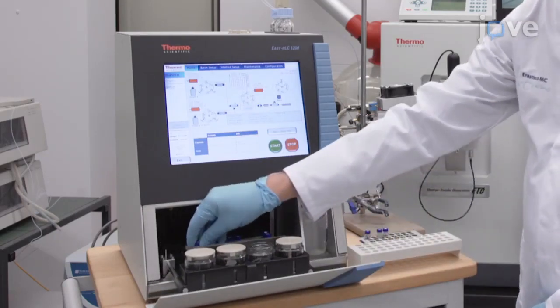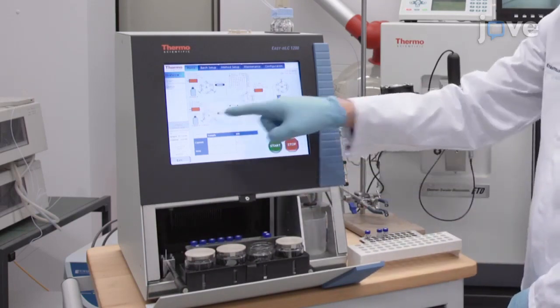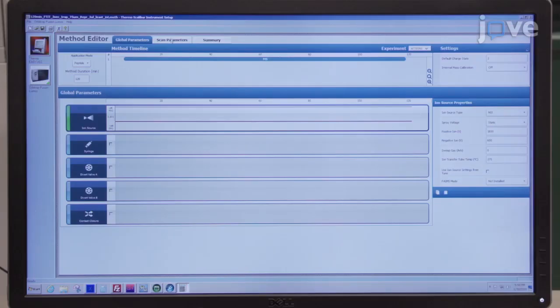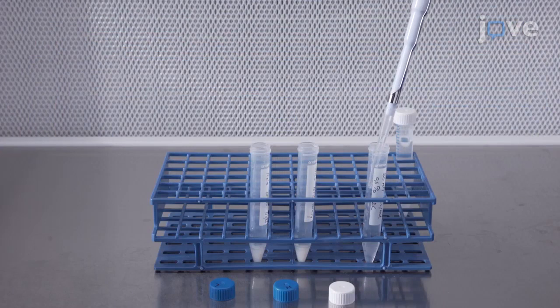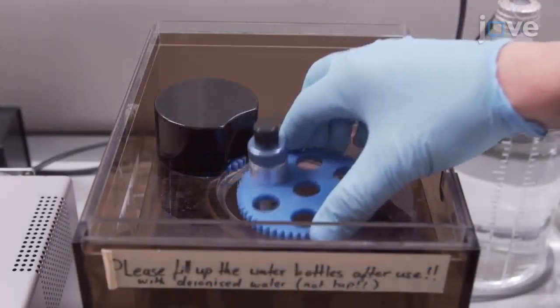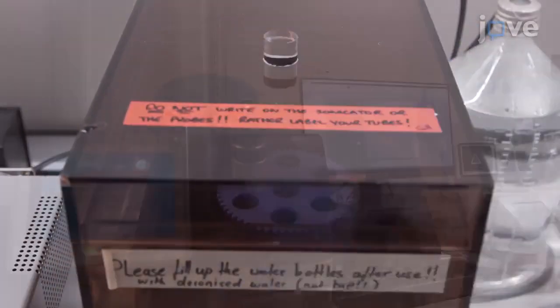We have made several improvements to the analysis of diglycine peptides that originate from ubiquitinated proteins. These include crude peptide fractionation prior to enrichment and the application of more advanced peptide fragmentation settings in the Orbitrap. Altogether, this results in a larger coverage of the ubiquitinome.